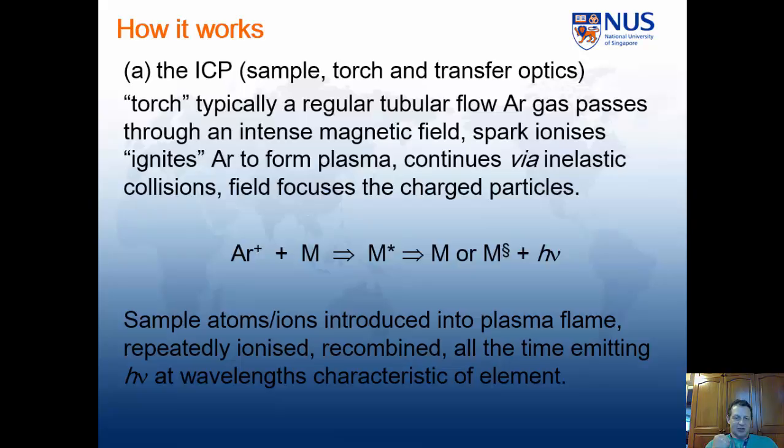So then we have our nebulizer. We introduce our sample as a solution usually into the plasma, and there immediately the metal atoms are collided with by the very excited, fast-moving argon plus ions, which effectively passes on enough energy to excite the ground state electrons of the metal into an excited state, and then all that happens is that the excited state decays, the electron drops back to a ground state, not necessarily the lowest vibrational level of the ground state, and emits a characteristic radiation as it does so.